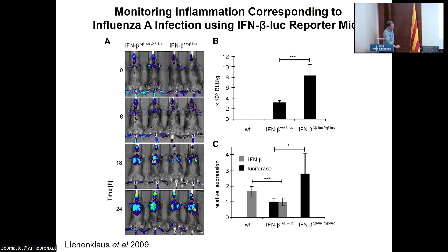So I'm going to move on and show you some images also from using virology as well. Most of what I've done in my career has been bacteriology, but I've also dabbled in virology. I took my master's degree in virology, and used to work for Wellcome Foundation back in the 80s, developing foot and mouth disease virus vaccines. One of the things about viruses is that some of them are very small and they're hard to engineer. And a way around this, as you can see from this paper from 2009, is to use transgenic animals.